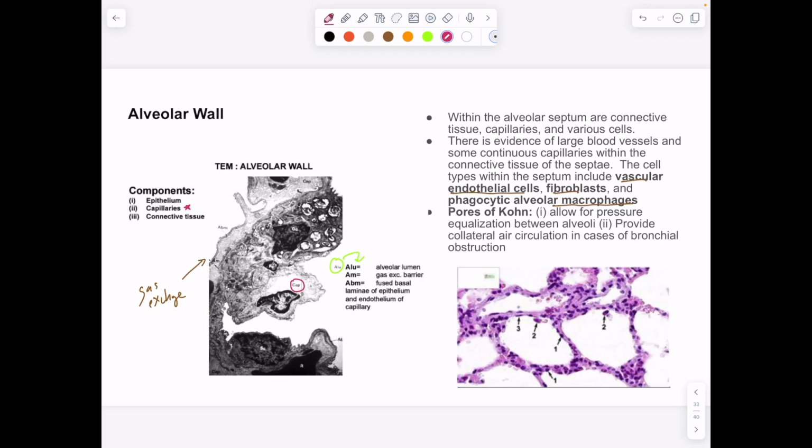All right, so moving on, in the alveolar wall, right? We have on the outside type 1 pneumocytes, which are very spread out, but inside of this, you want the gas to go through the type 1 alveolar cell and get into the wall where they should meet some capillaries, right? And so this is an electron micrograph of an alveolar wall. It is terribly labeled, but important to know, here's a capillary right there. And here's the nucleus of the endothelial cell that is making that capillary.